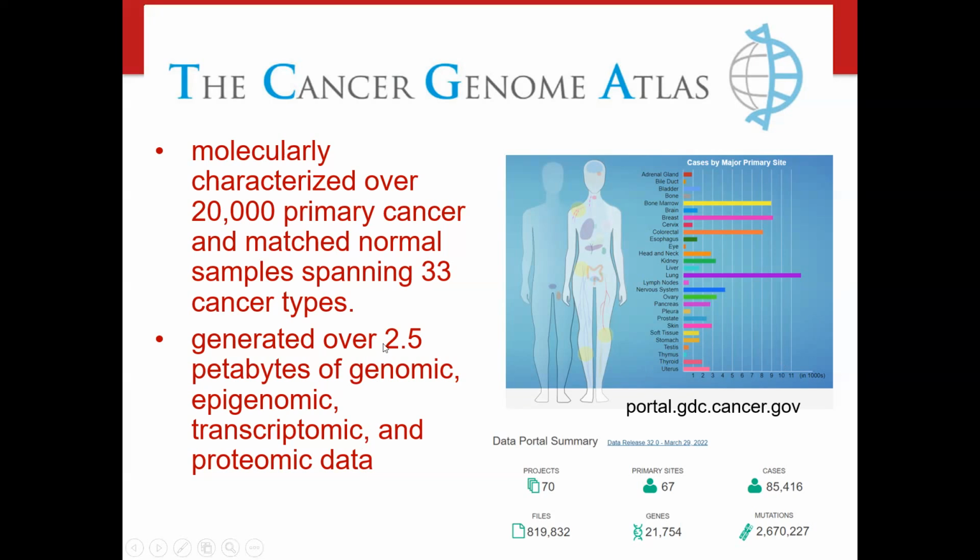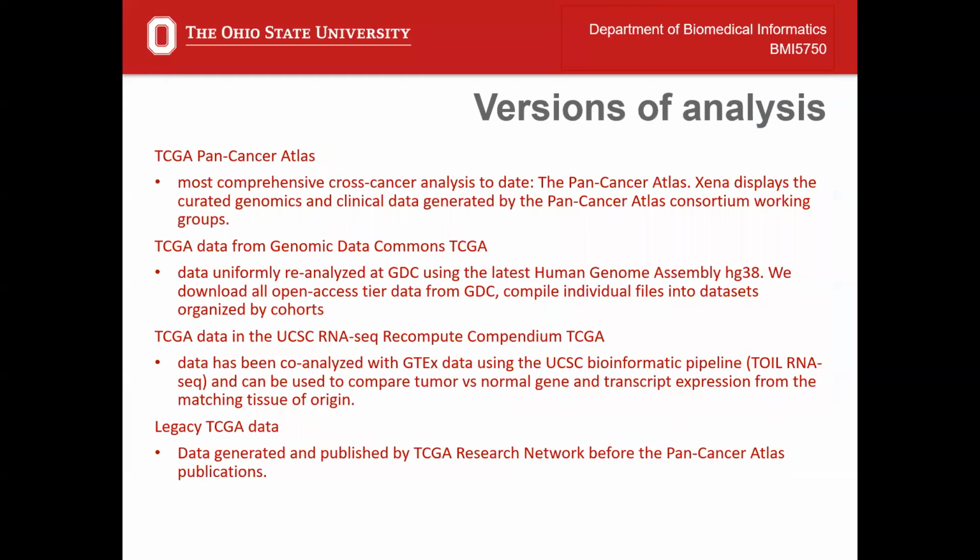They say they've generated over 2.5 petabytes of genomic, epigenomic, transcriptomic, and proteomic data. So there are a lot of different data sources built into this database. There are different versions of the analysis on TCGA. I'll start at the bottom here, the legacy TCGA data.